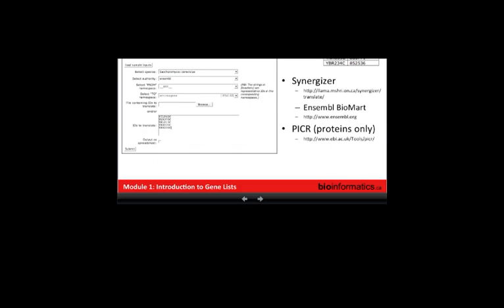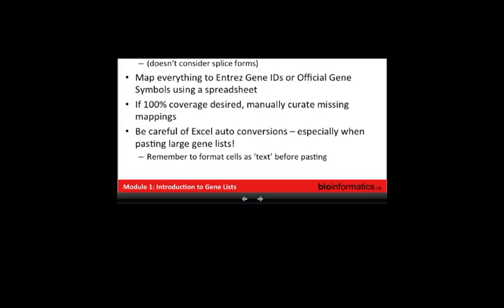There are identifier mapping services — websites where you can paste a whole bunch of genes and convert them to another set. Here I'm converting gene symbols to Entrez gene IDs using Synergizer. For quick recommendations: for proteins and genes, try to use gene identifiers — either Entrez gene IDs or the official gene symbol. You might need to use different websites to do conversion if you don't get 100% conversion, or manually curate the missing mappings. Be careful of Excel auto conversions — remember to format everything as text before pasting.